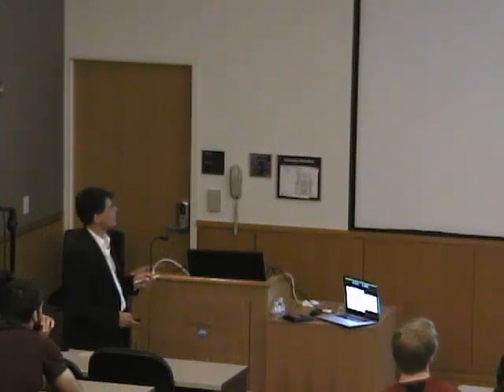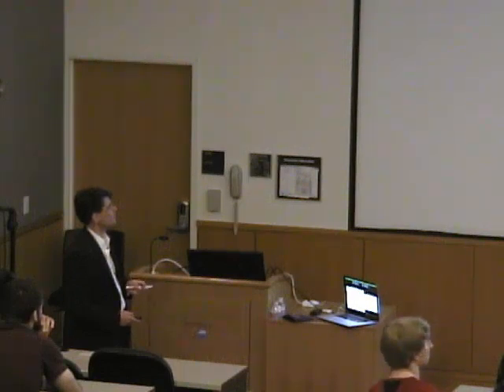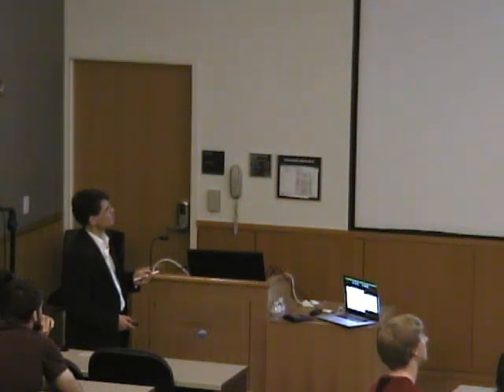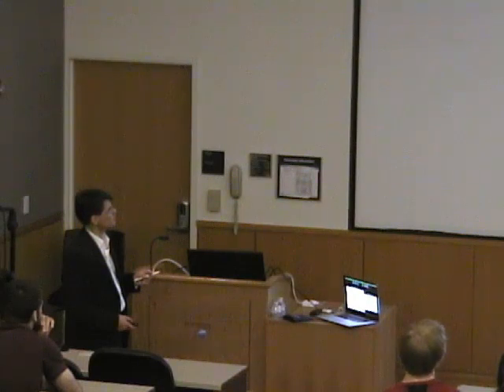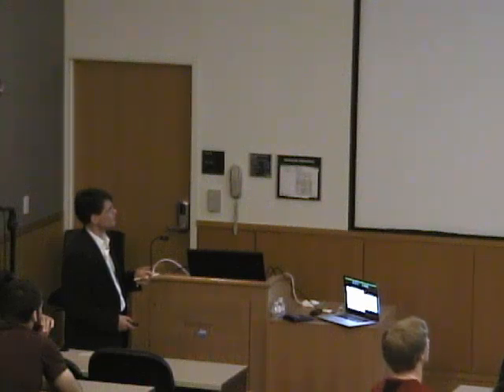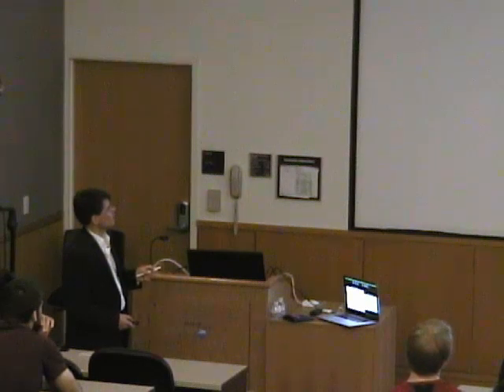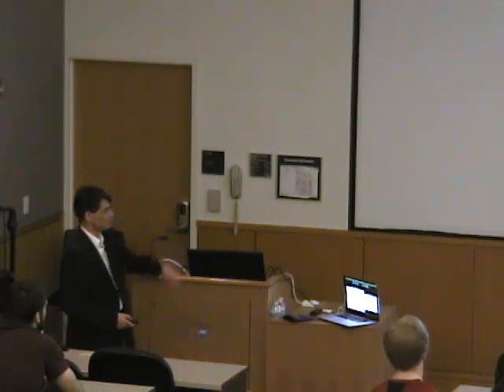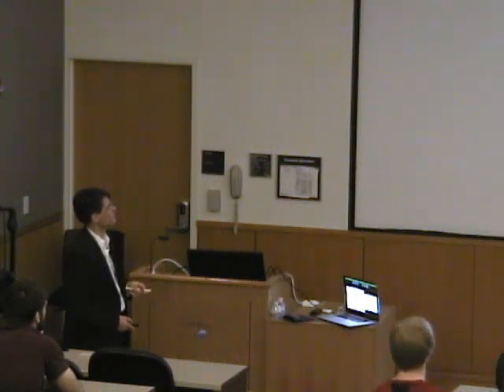Okay, you have seen this slide. I told you that there are these A, B, and C terms that give rise to the MCD signal. Now, the phenomenology is the following. f of E is a line-shaped function, probably a Gaussian. The B term is directly proportional to that line-shaped function, so that is simply an absorption-shaped band that can be positive or negative. The signature of the A term is that it's derivative shaped. It has the shape of the derivative of an absorption band, so it goes up and down or down and up.